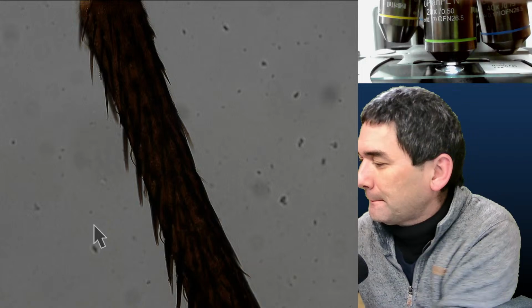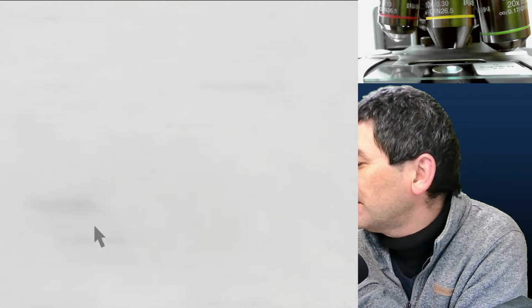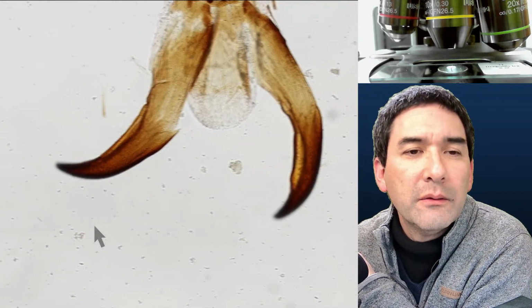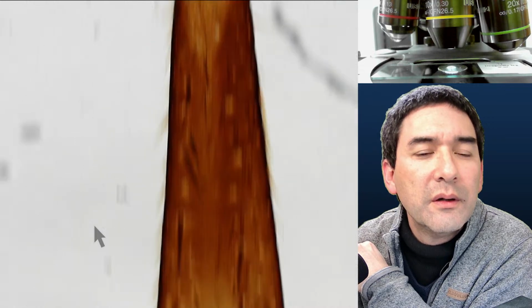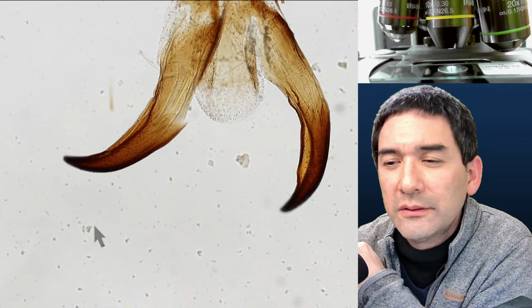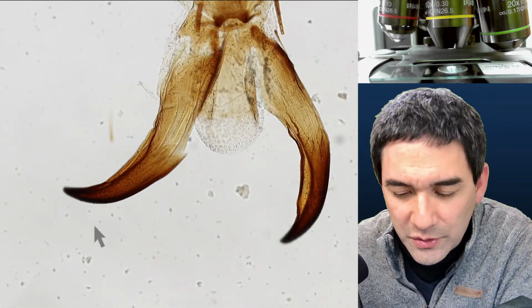Dragonfly leg. Go down a little bit. Now the whole table is full of slides, all completely jumbled around. So where is this here? This is the leg of a dragonfly. Ooh, that's a huge one. Now, these are some gigantic claws here. That's interesting. Okay, and mosquito, honeybee antenna.